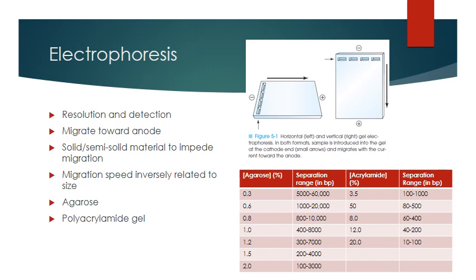If we know that the gene we're looking for is 1,000 base pairs long and we know the sequences that it'll start with, well, let's cut first with a restriction endonuclease, and then if we know it's 1,000 base pairs long, we'll use a 0.6% agarose gel, and we'll separate it out, and we'll be able to have only those sequences that we work with, everything else we washed out. It's easier. We're shrinking the size of our haystack. Okay.